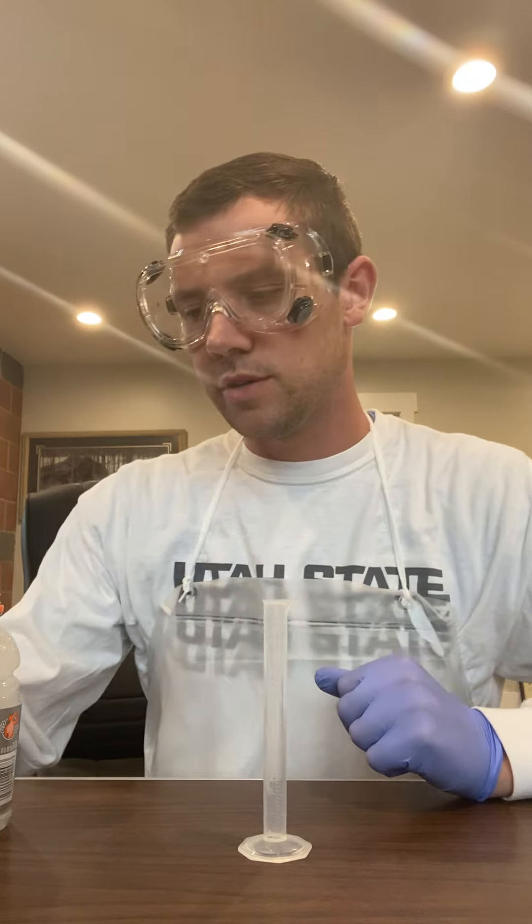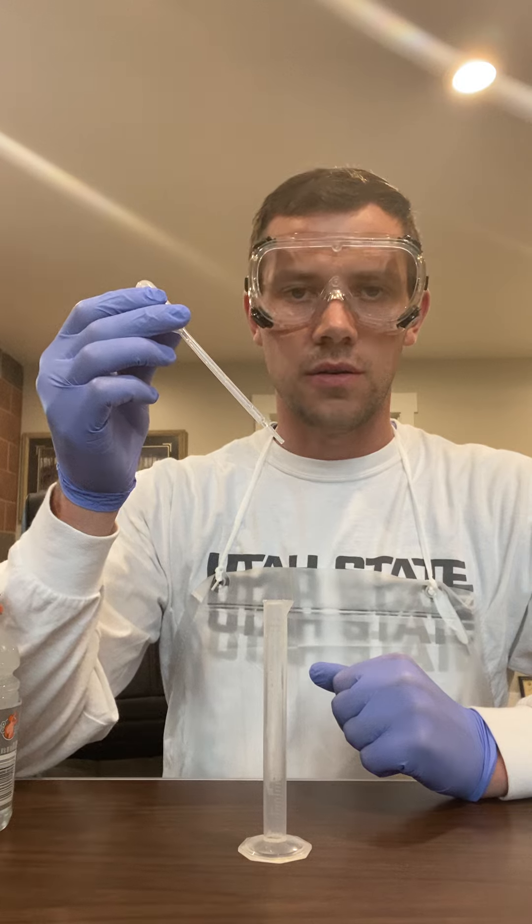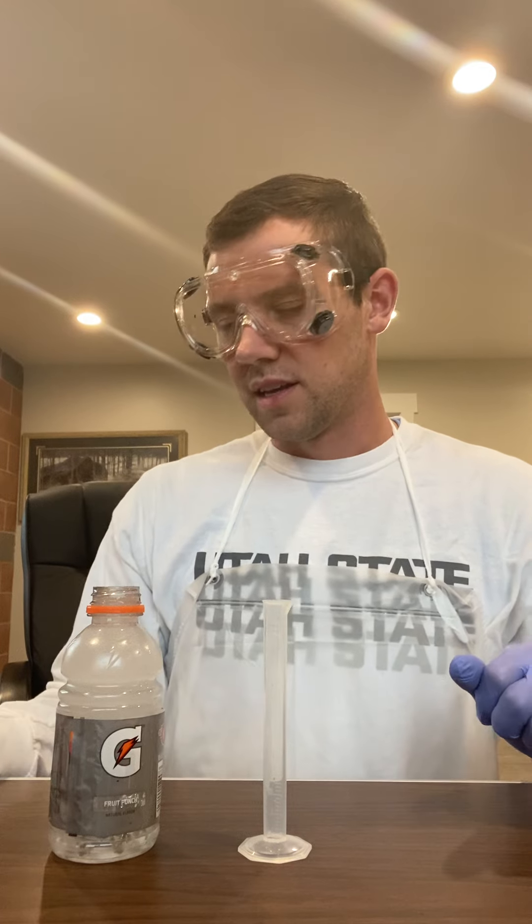Alrighty, for one of our last lessons for the day, we're going to learn how to measure volume via a pipette. So what we have here is a Gatorade bottle full of trusty old H2O. It's a little bit cloudy because I just filled it up from the tap and it's pretty bubbly. Nothing to be concerned about, it's still just water.